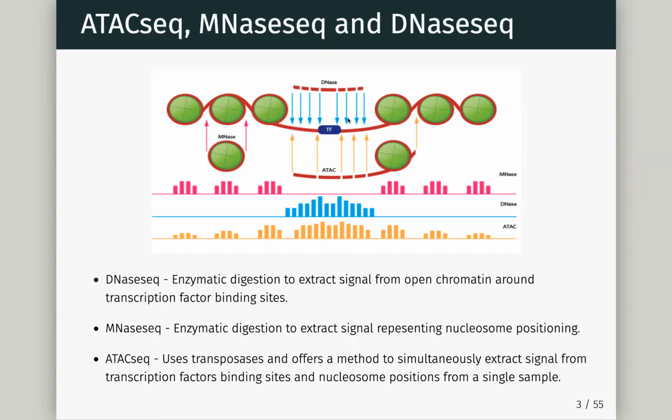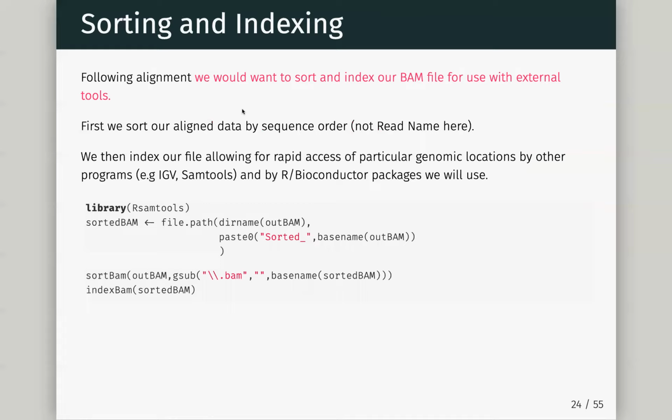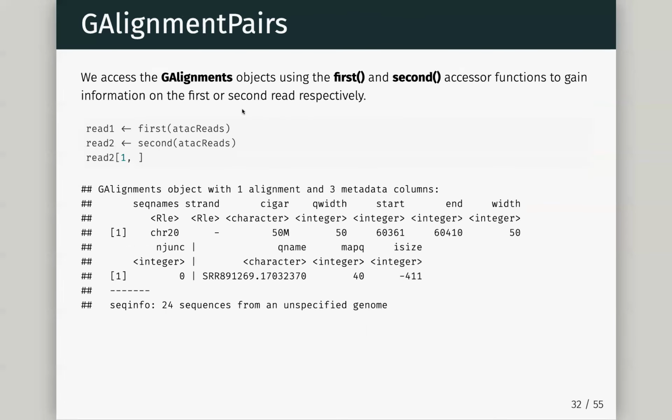But there still could be, for whatever reason, you managed to collect a fragment which didn't chop anywhere, and you managed to sequence that. The idea is that by getting the transposase concentration right, you're going to break up your DNA in a reasonably efficient manner. If you really lowered that, you would get no breaking up, and then you would end up with really long fragments. Quite common is that people over transposase their data.